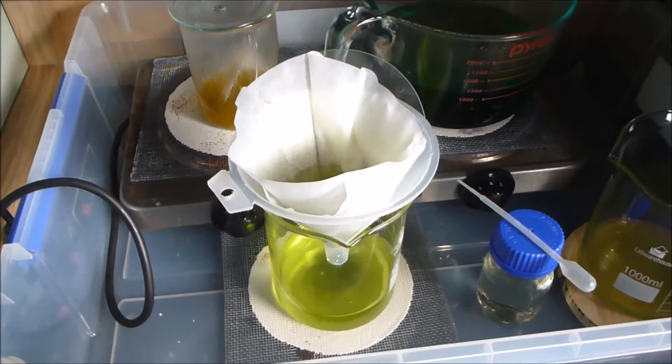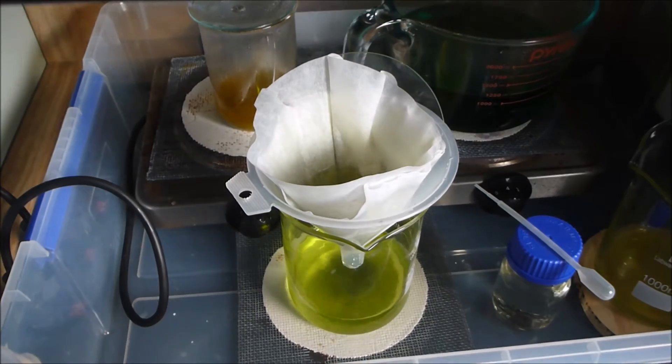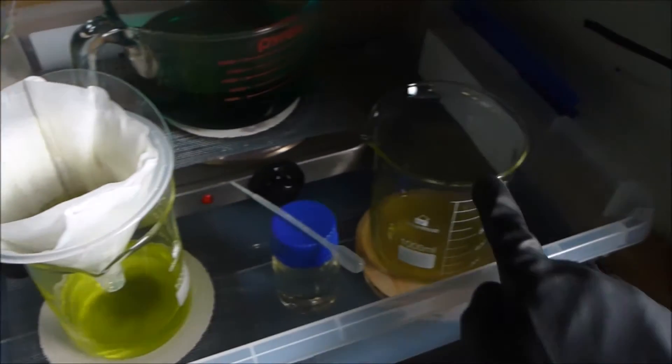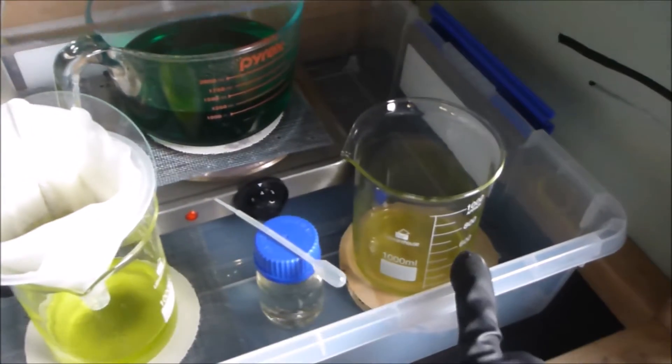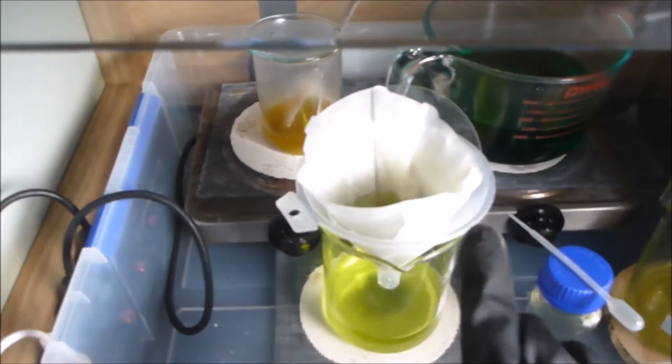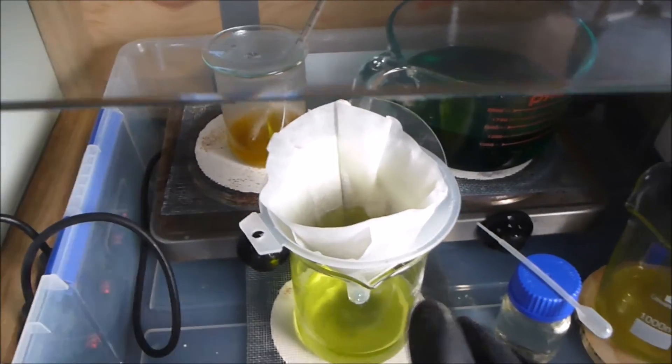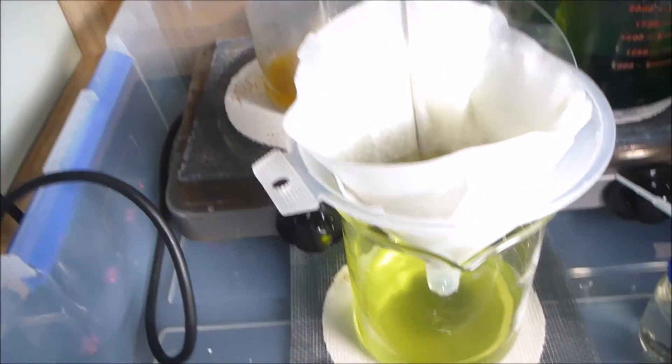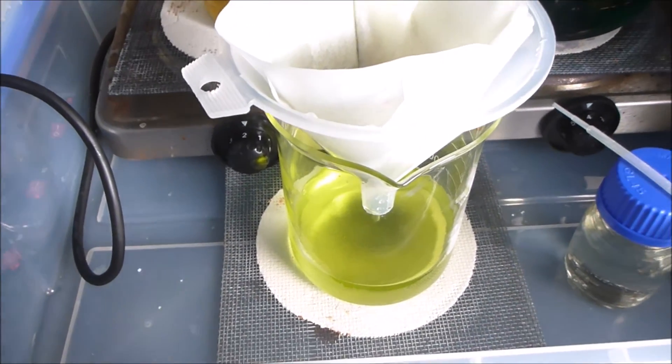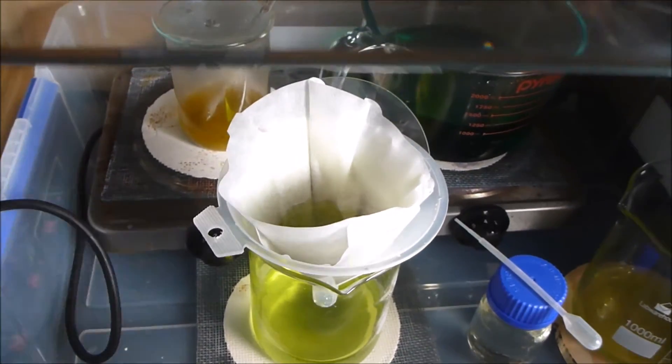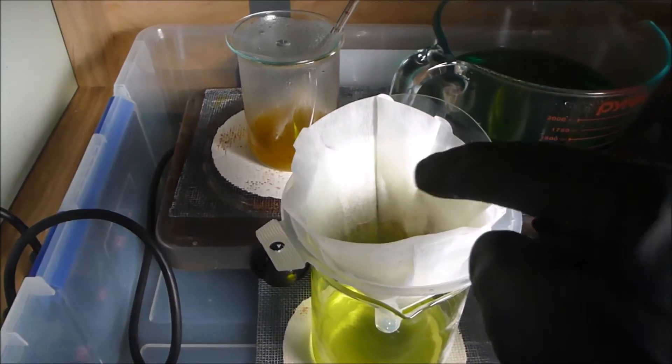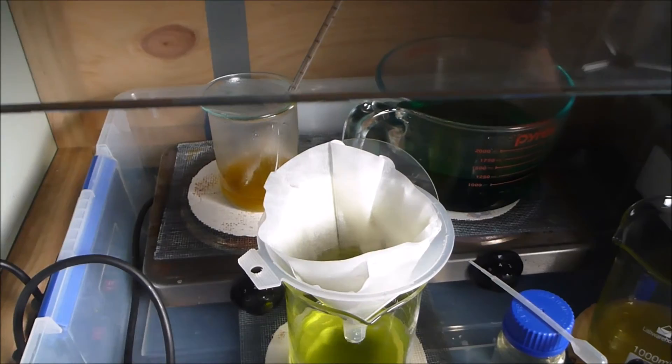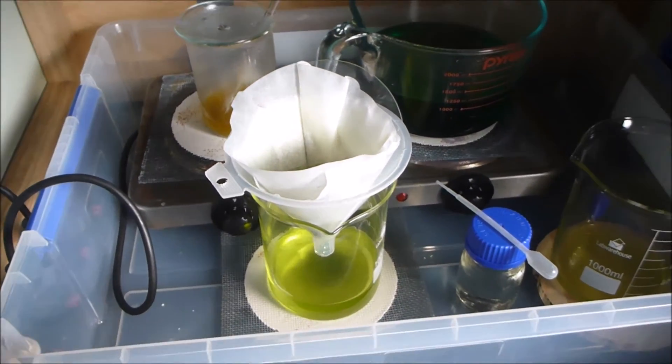What happens is the big holes in the coffee filter get plugged first by the big particles, but the small particles make it through. By the time you've done it two or three times, the holes are mostly plugged with the small particles as well. It's going very slow, as you can see - one drop at a time. You can see in the filter there it is catching a lot of that really fine stuff now.